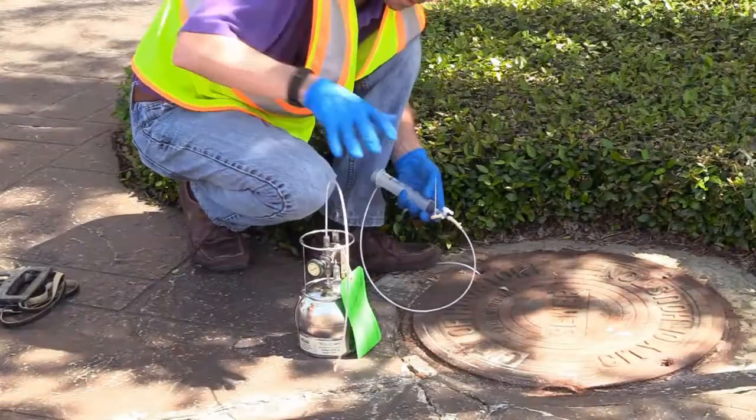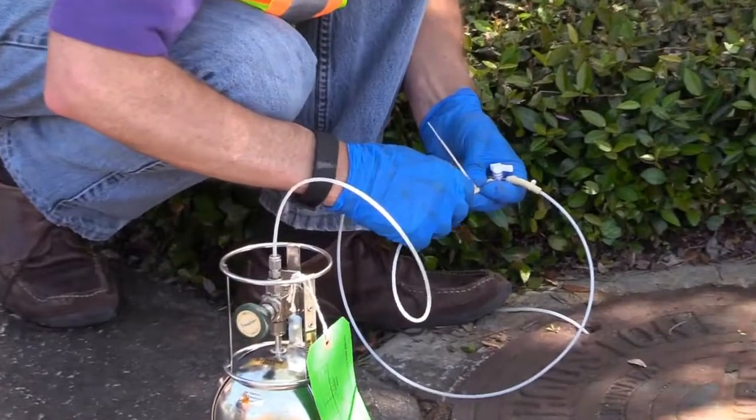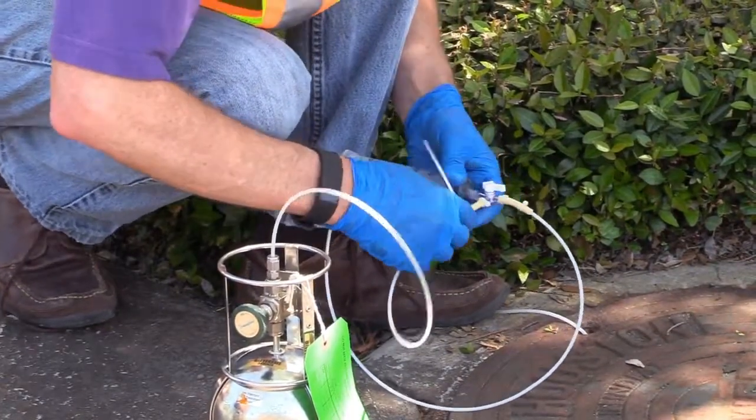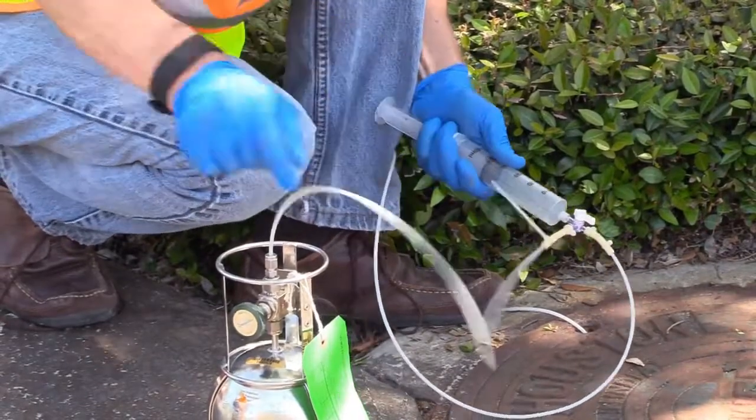The SUMA canister can be connected to the sample line through the three-way valve. The syringe can be used to check for leaks and also to purge the sample line running to the SUMA before using the three-way valve to connect the SUMA to the sample point.